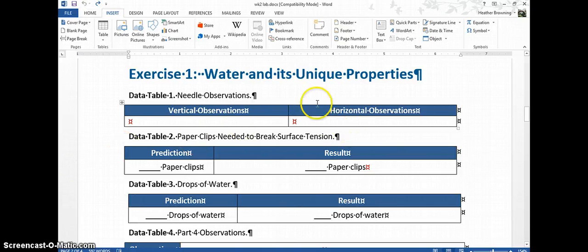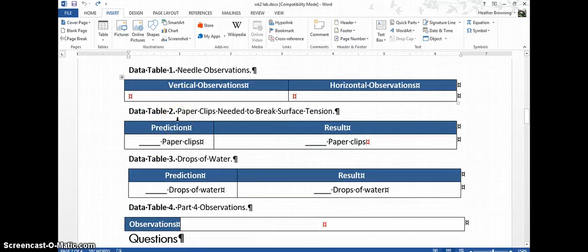So one way it should float, either vertical or horizontal. If you're not seeing it float, try using tweezers to drop it in. Look online to see what should be happening or what other people have found. And then try to figure out how to correct your issues.